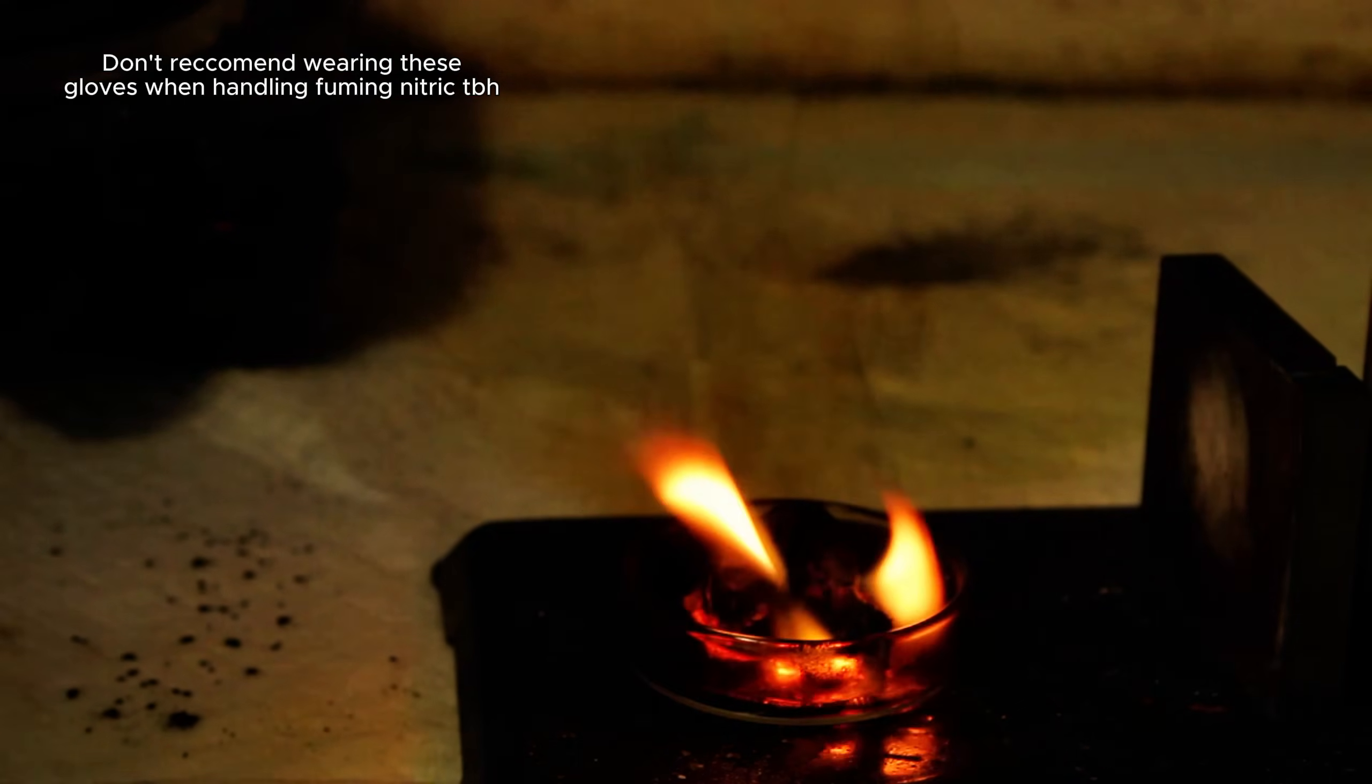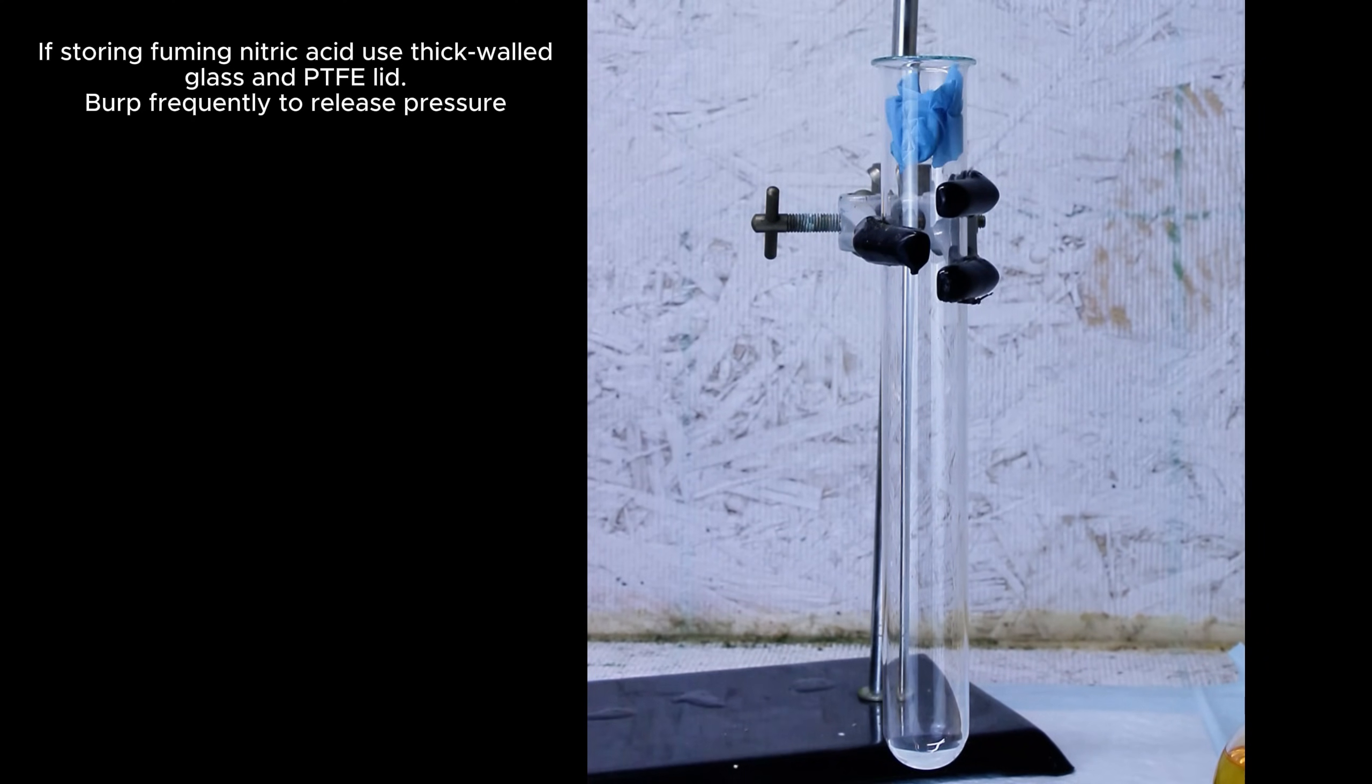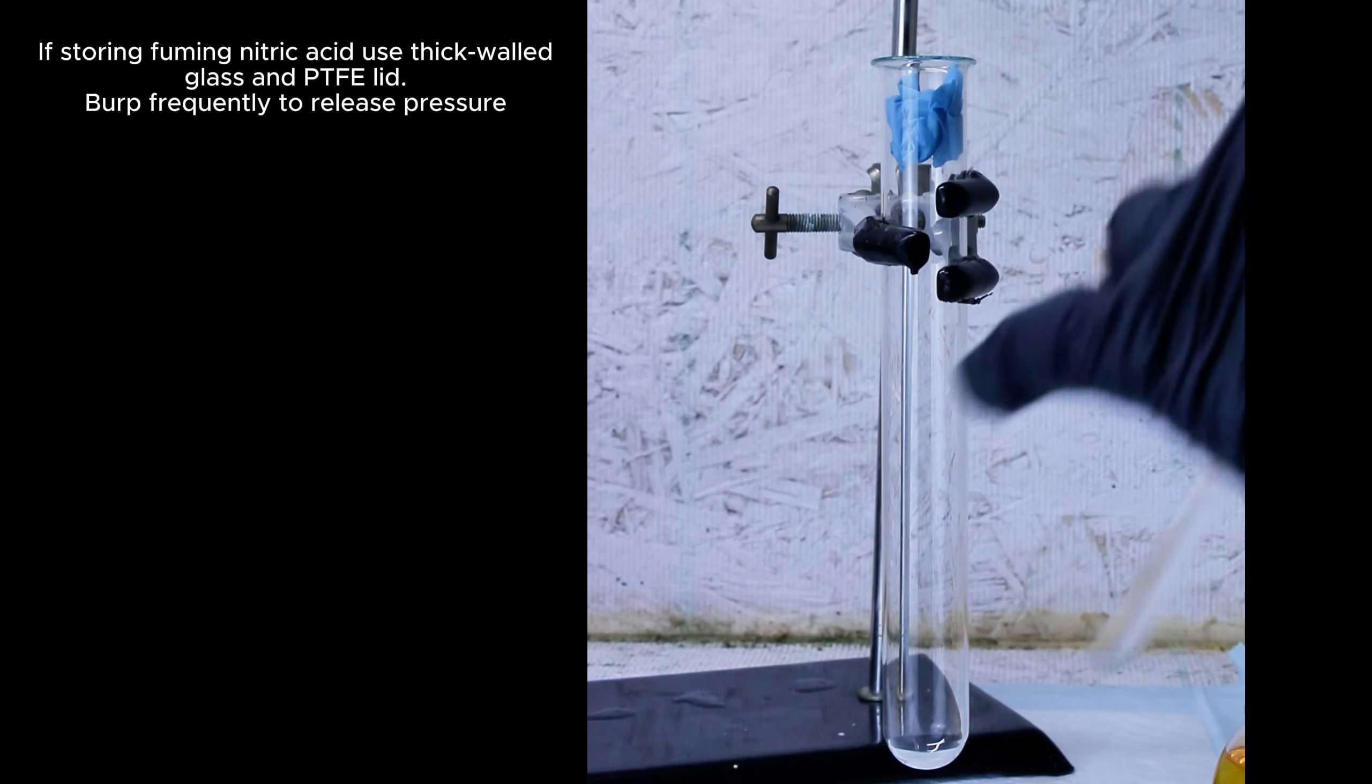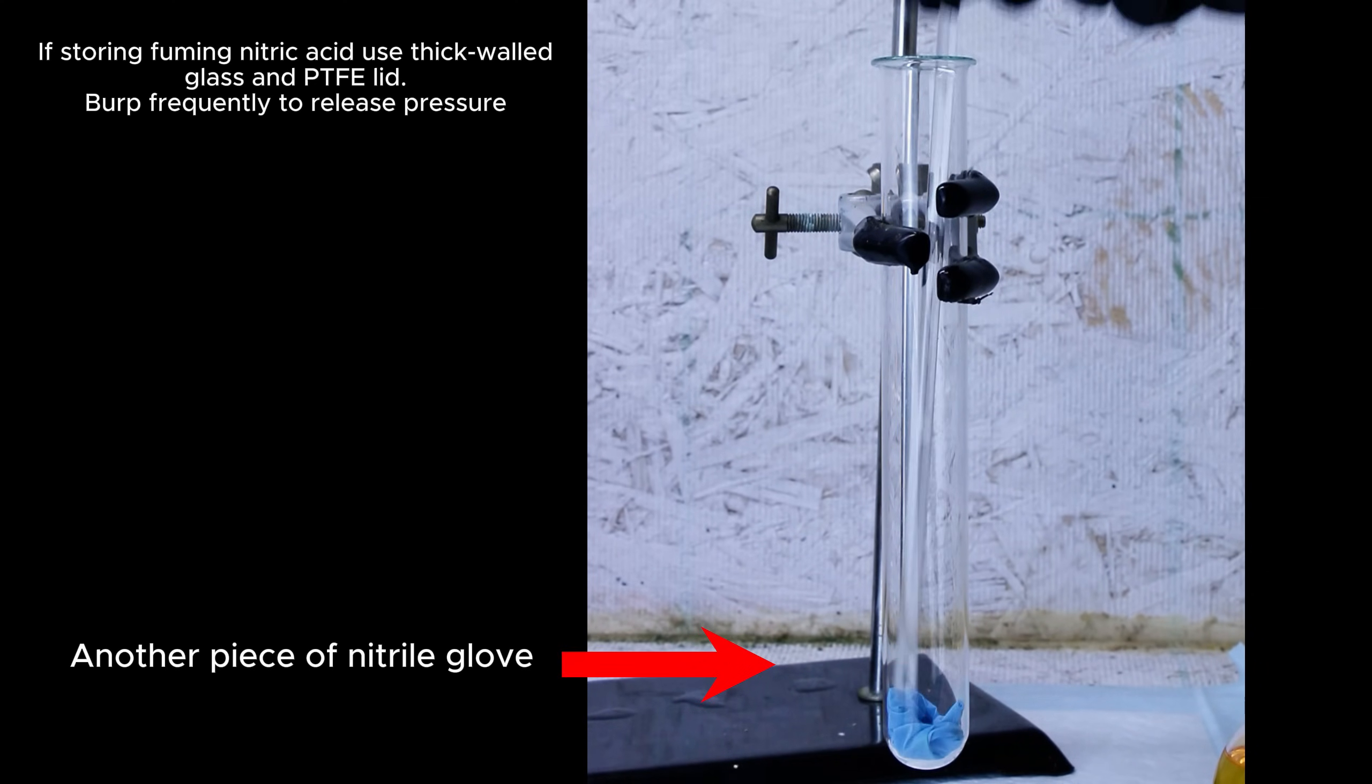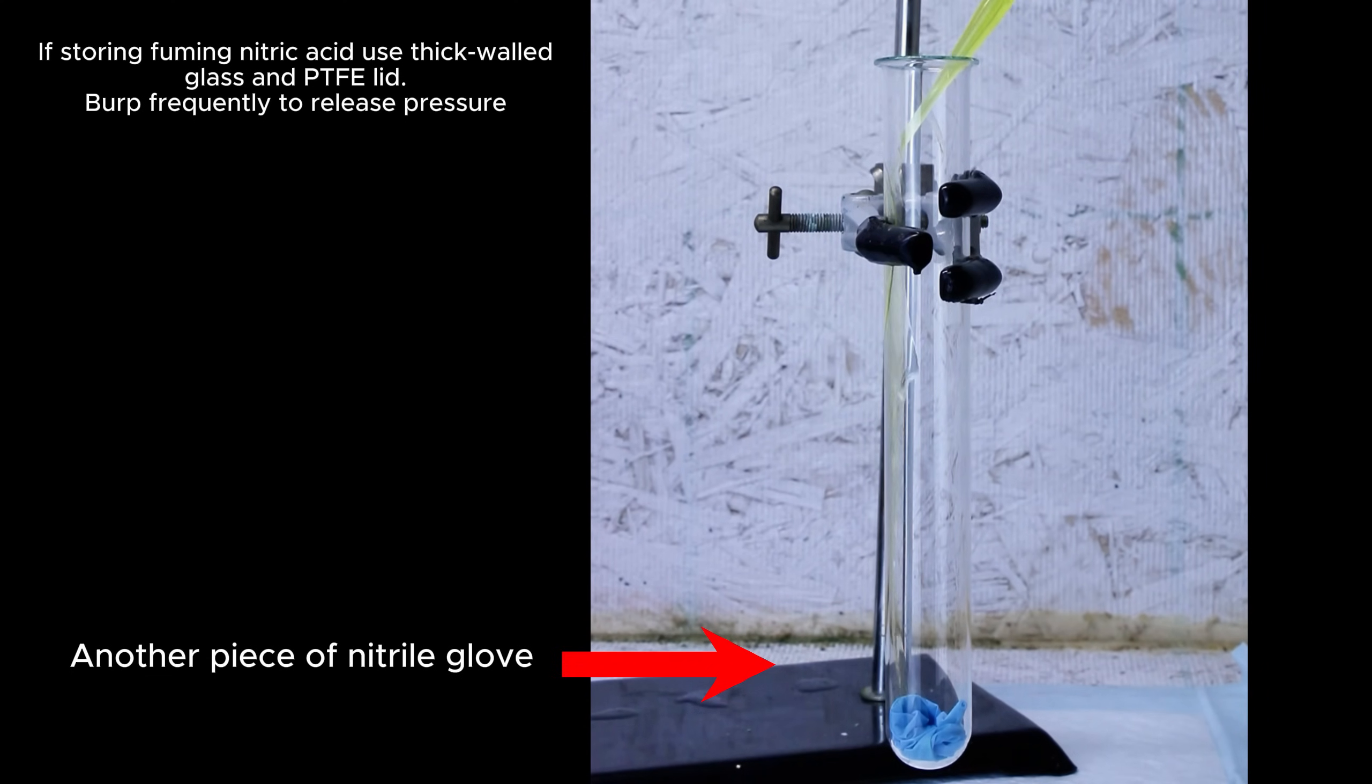As for storage, fuming nitric acid will slowly decompose at ambient temperatures which will pressurize whatever container is being stored in at the time. That said, containers of fuming nitric acid are almost always made of very high density glass and routinely burped to prevent pressurization.